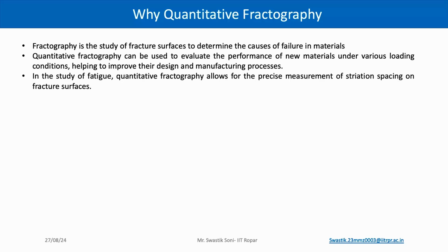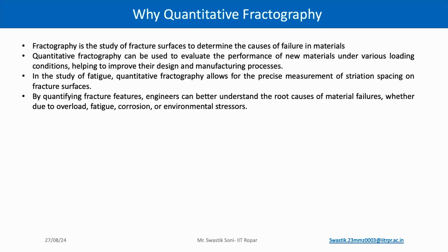In case of fatigue, quantitative fractography allows precise measurement of striation spacing on the fracture surfaces. And by quantifying fracture features, engineers can better understand the root cause of material failures, whether due to overload, fatigue, corrosion, or environmental stresses.